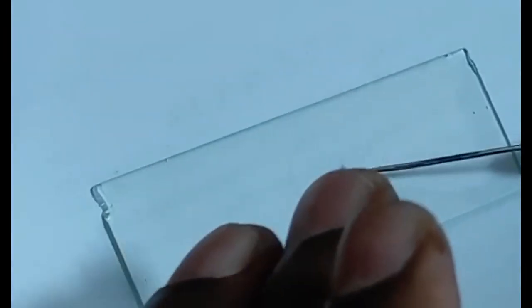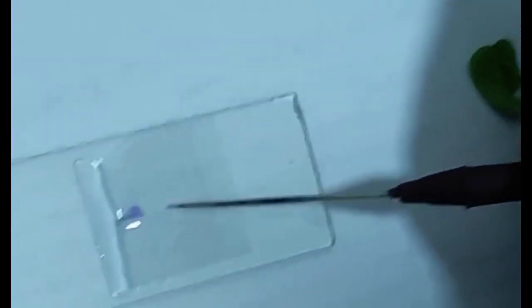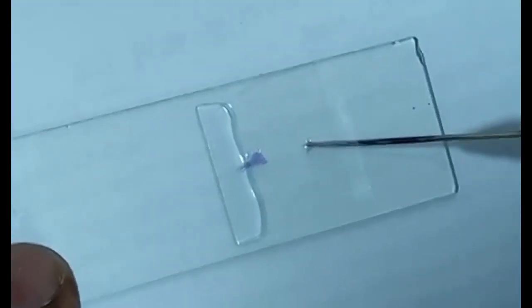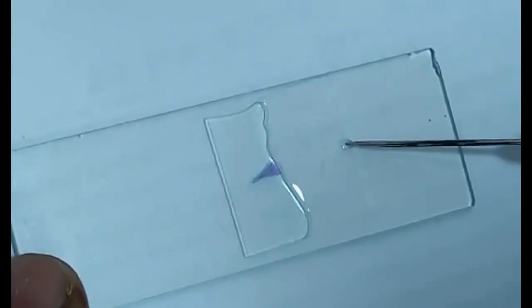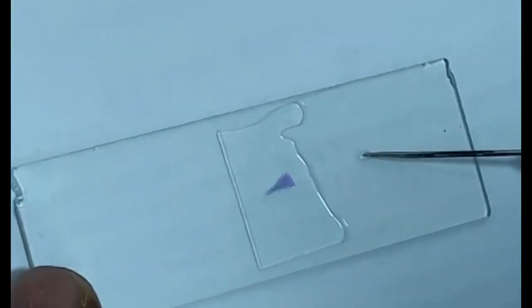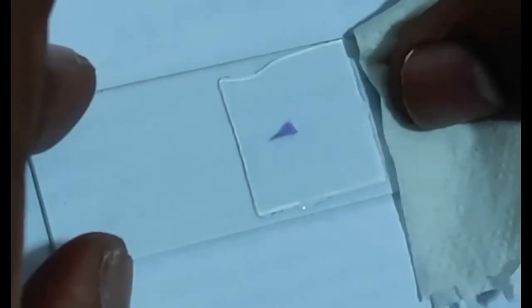This has to be covered with the glass cover, that is also called a cover slip. Carefully, without formation of air bubbles, we have to spread it over by use of a needle. And the extra water can be absorbed by use of tissue paper.